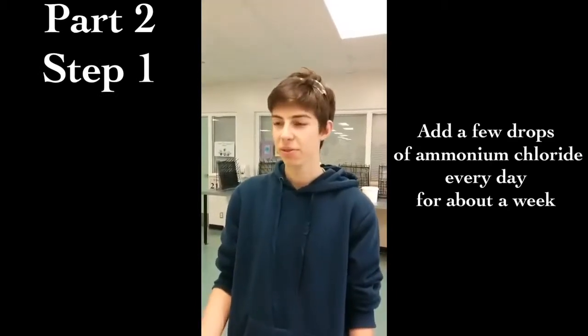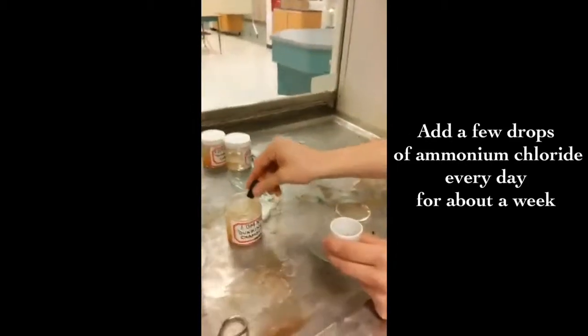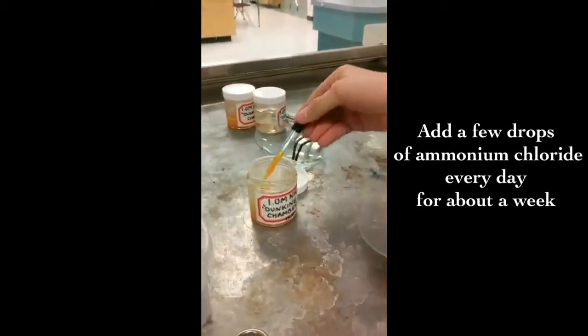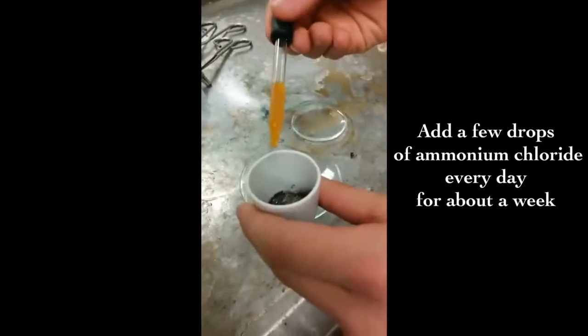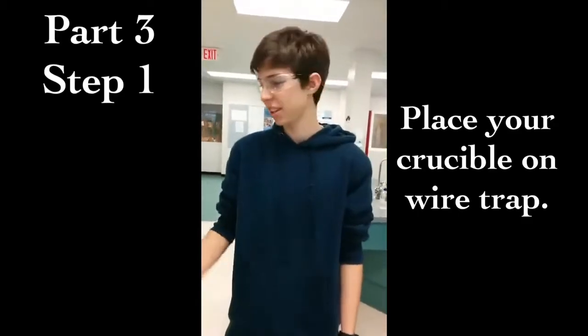Part 2. For the next few days, we're going to use the medicine dropper to drop some drops of ammonium chloride onto our steel wool to keep it nice and moist. Now we're on our final day. It's time to get our crucible.